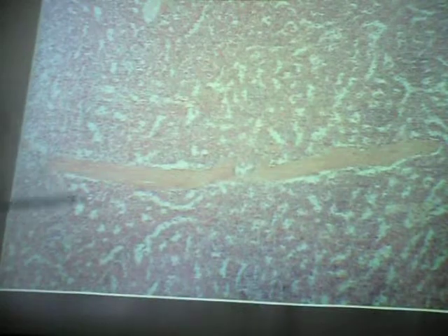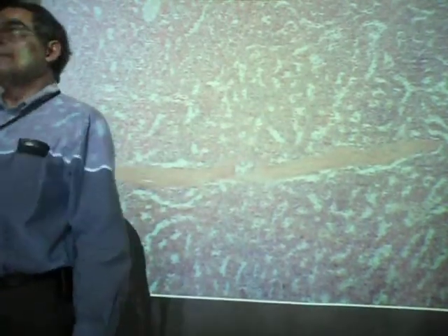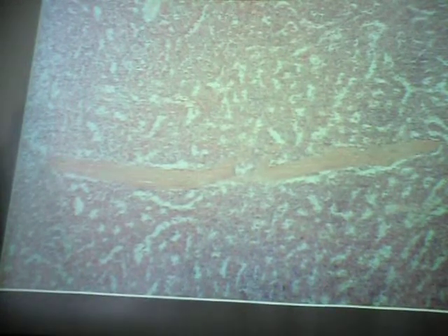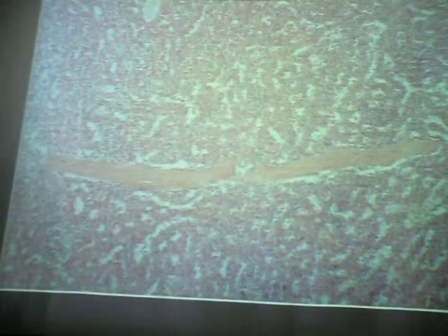Okay. And out here, these cords, tissue around it, what do they call it? Splenic cords. Or if you want to be fancy, you call them Billroth's cords. And what kind of cells do we have here? Erythrocytes? Not in the cords. Oh. Lymphocytes. It's a lymphatic organ. Should be a given, okay? We got to have lymphocytes, all right? So we got lymphocytes here. What else?